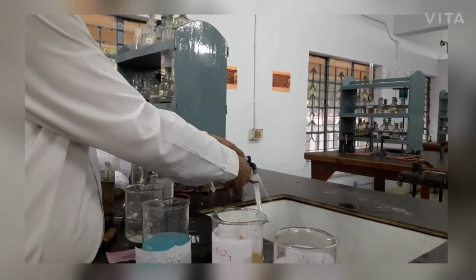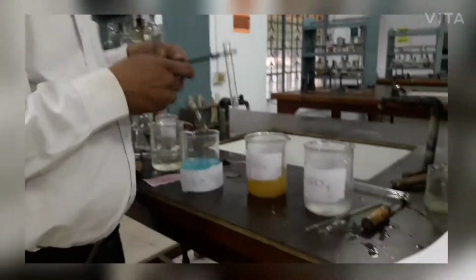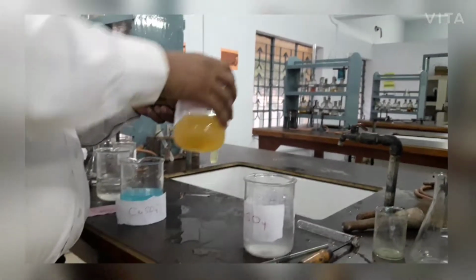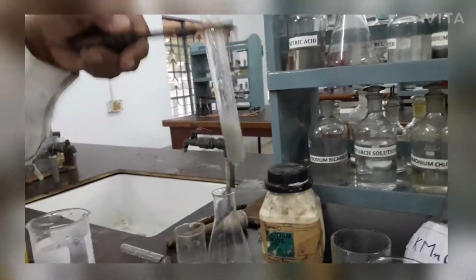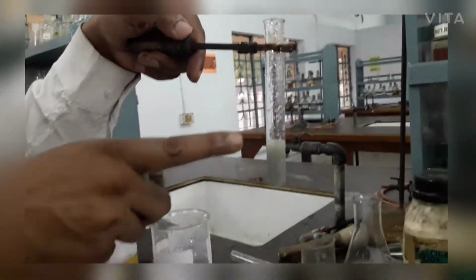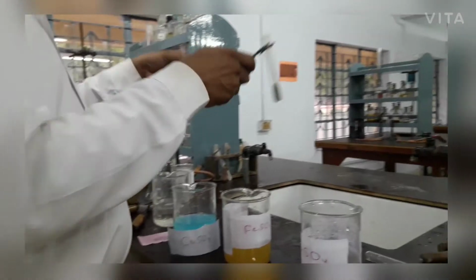Now we take iron sulfate and we add a small amount of aluminium. We observe here aluminium displaced iron, so color of the solution changes. Means here aluminium sulfate is formed because aluminium is more reactive than iron.